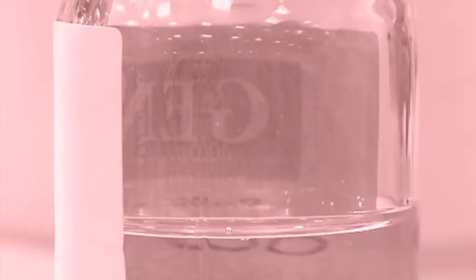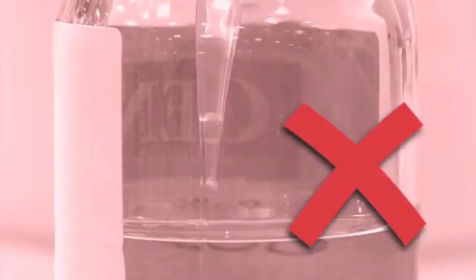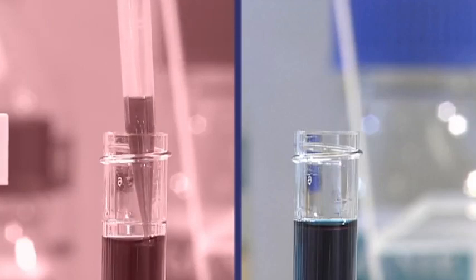If you don't pause after you release the push button, there won't be enough time for the correct volume to be taken into the tip. Air will be taken in instead. Also, when you're withdrawing a large volume from a narrow container, make sure the tip stays below the surface.